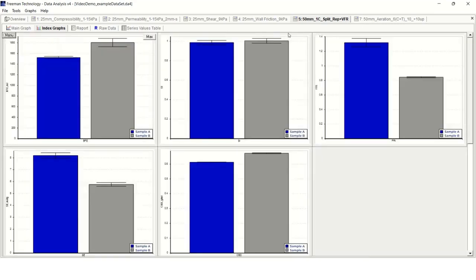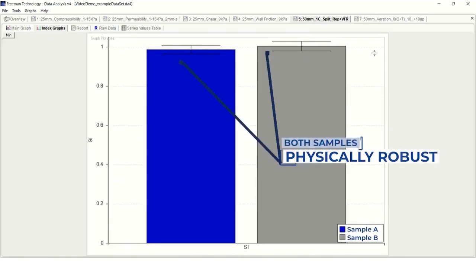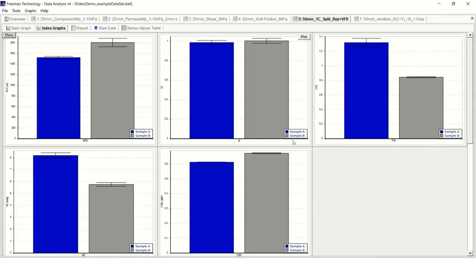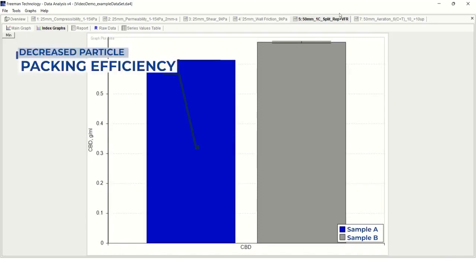Both samples were shown to be physically robust, with stability indices near unity. Lastly, we can compare these two samples based on their conditioned bulk densities. Here sample A was shown to generate a lower CBD value, suggesting it may have decreased particle packing efficiency.